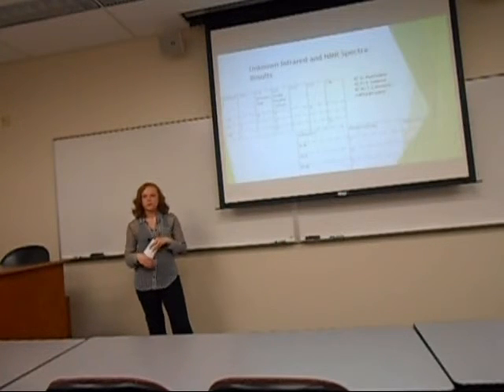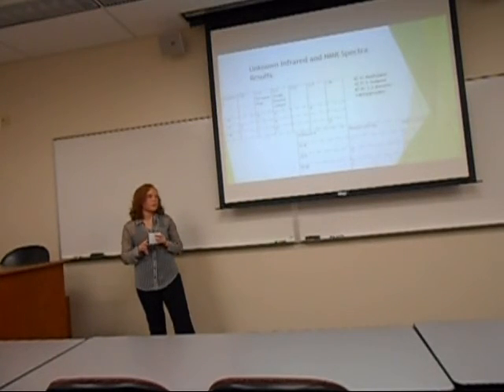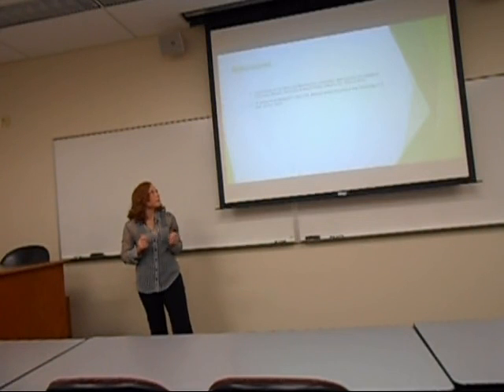So it was easier to determine the NMR based on the IR, because you're able to see something visual instead of going off of a Lewis structure. So that was my presentation, and those were my unknowns, and here are my references.